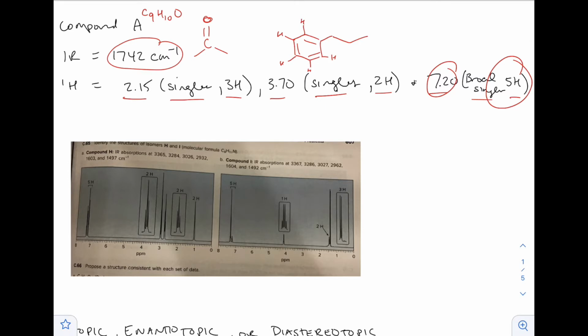I'm going to take a look at the rest of the NMR data to help guide me, to make sure that carbon connectivity is correct, which it has to be, and also to see where that carbonyl group goes, because technically we could have it here, here, or maybe here. That's not the best option, because you would have an aldehyde and we'd have an additional resonance, so that leaves us with the 2 internal ones.